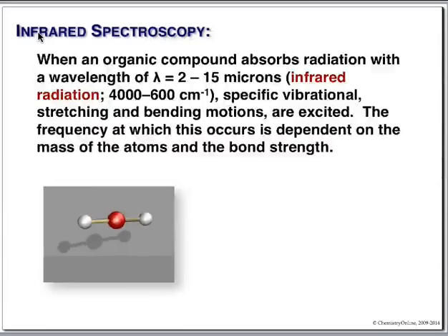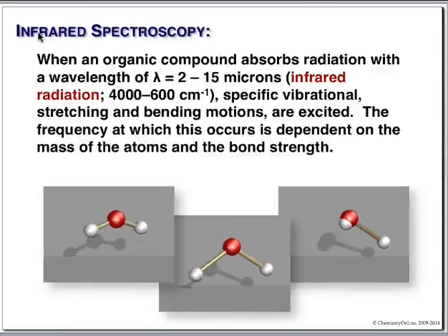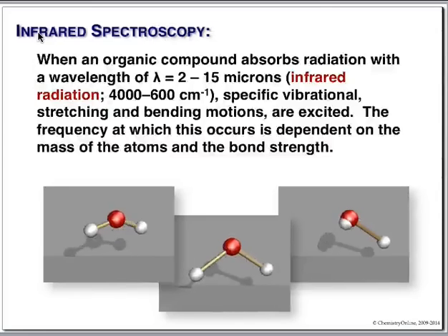All right, so let's go ahead and get started. Infrared spectroscopy. Basically, in the machine, you're going to be shining light of about this wavelength, 2 to 15 microns. A micron is a measure of length, isn't it? 10 to the minus 6 meters. If you converted that into centimeters and took its reciprocal, don't ask me why in the world somebody did this, you wind up with a unit known as a reciprocal centimeter or a wave number.